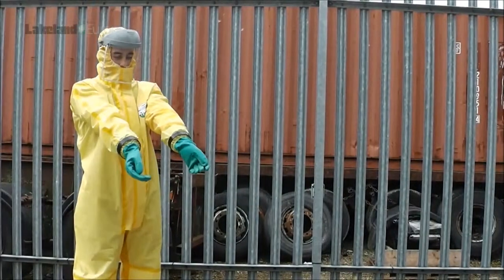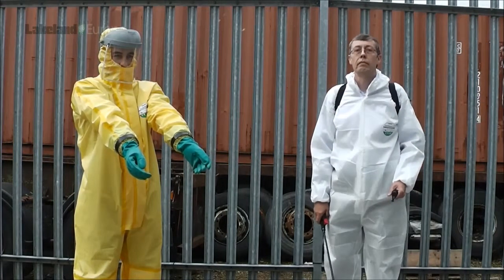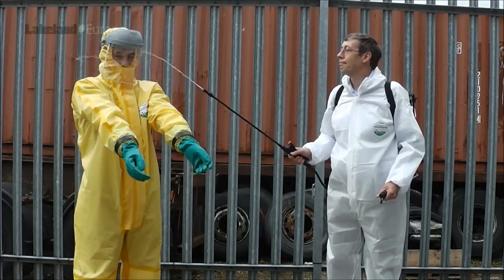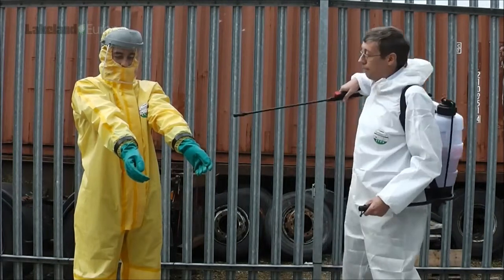We asked Romain to stand with arms outstretched. Then we asked John to spray Romain with the liquid. Not in the face, John — on his arms, wrists and hands. We're testing the push-fit glove system, remember?